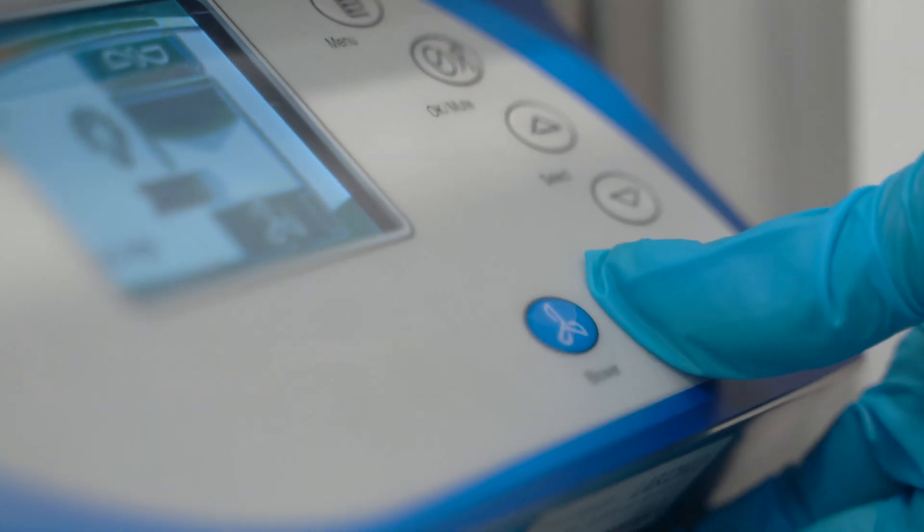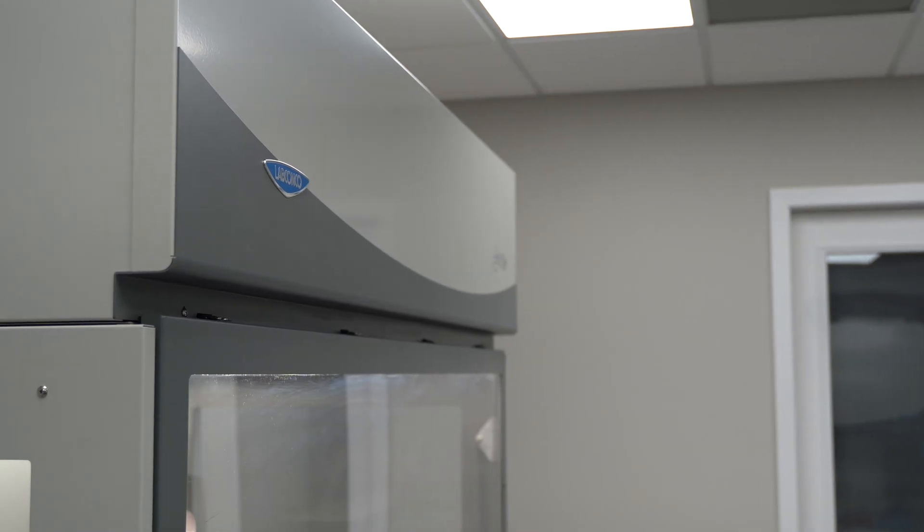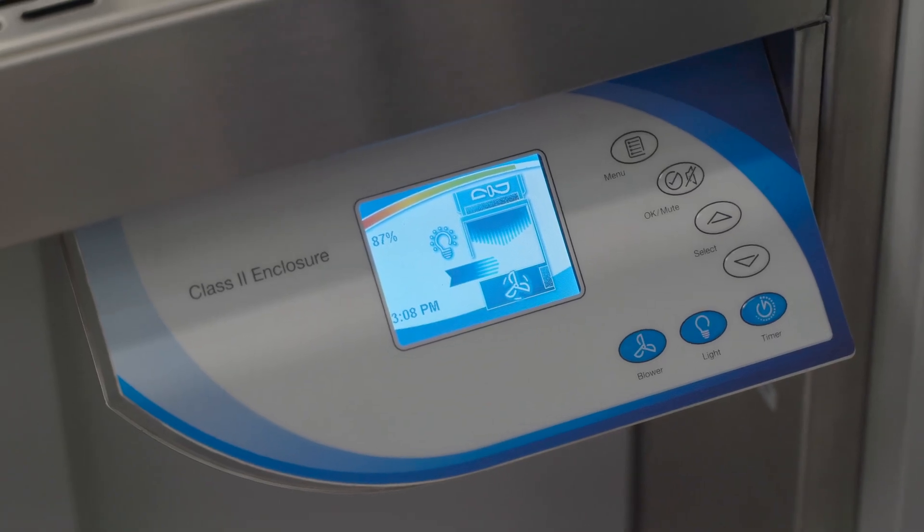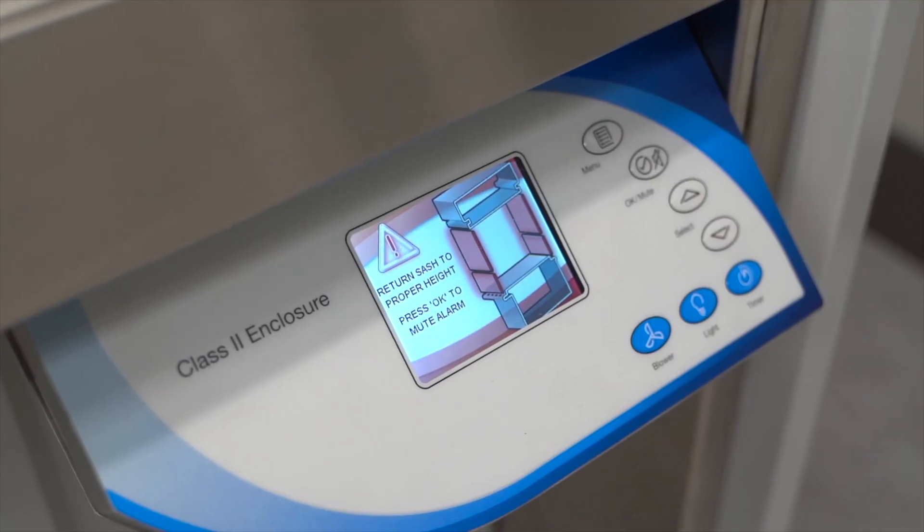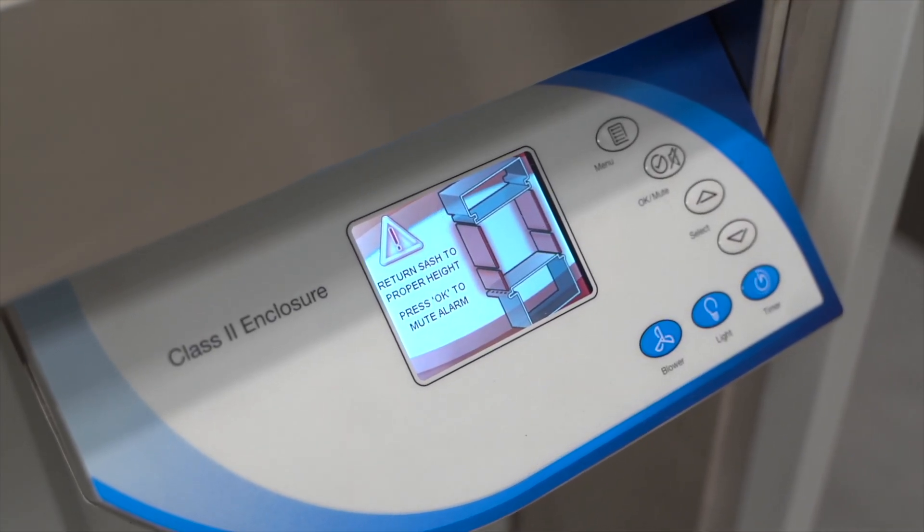The LogicView is powered by MyLogic OS, an intelligent platform controlling all aspects of the enclosure. MyLogic clearly displays key information such as remaining filter life, alerts, and alarms. It also communicates with instruments to engage safety interlocks, pausing movement when the sash is in an unsafe position.